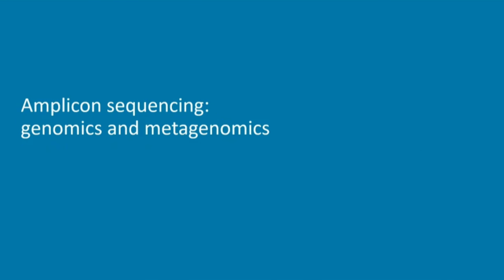So back to our topic today, amplicon sequencing. Before I go deeper into how we prepare the samples or what the amplicon sequencing workflow looks like, let me explain a bit about amplicon sequencing in the context of genomics and in the context of metagenomics.